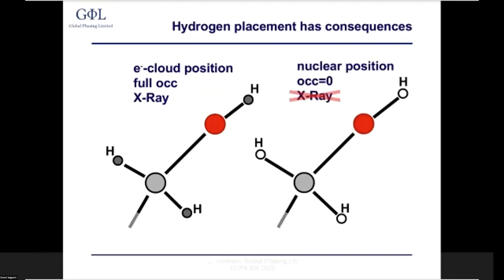In both cases, hydrogens will be visible to the geometry part of refinement, obviously with different bond restraints and also adapted contact term restraints. Please note that Buster does not use a so-called riding hydrogen model, but instead treats those atoms in the same way as any other atom, but with usually much tighter restraints. Although we only really have two possibilities here, it still makes all subsequent steps potentially more complicated and prone to user errors. So is there a third option?